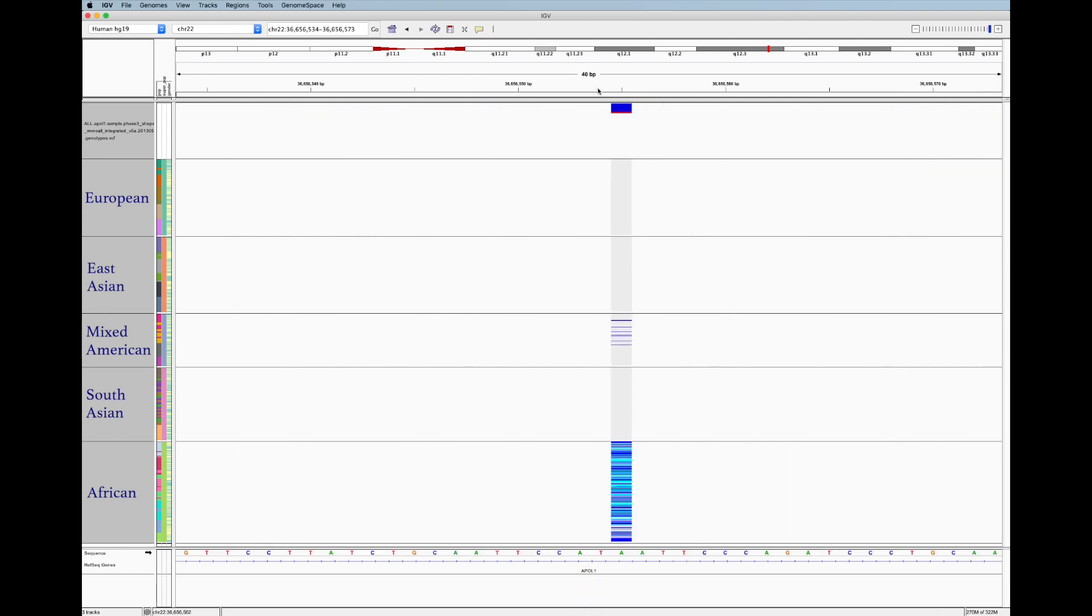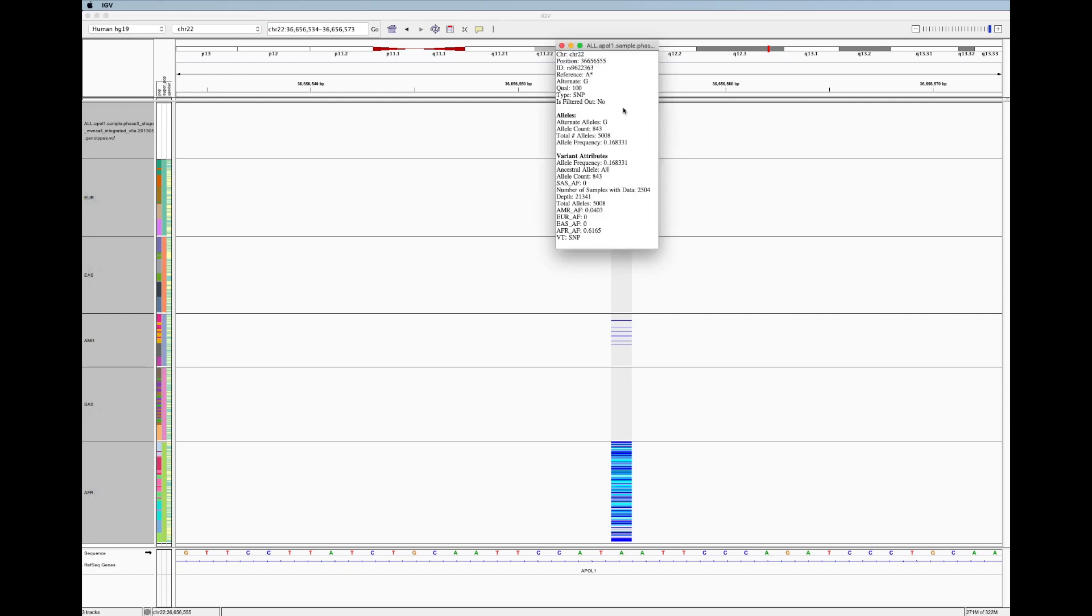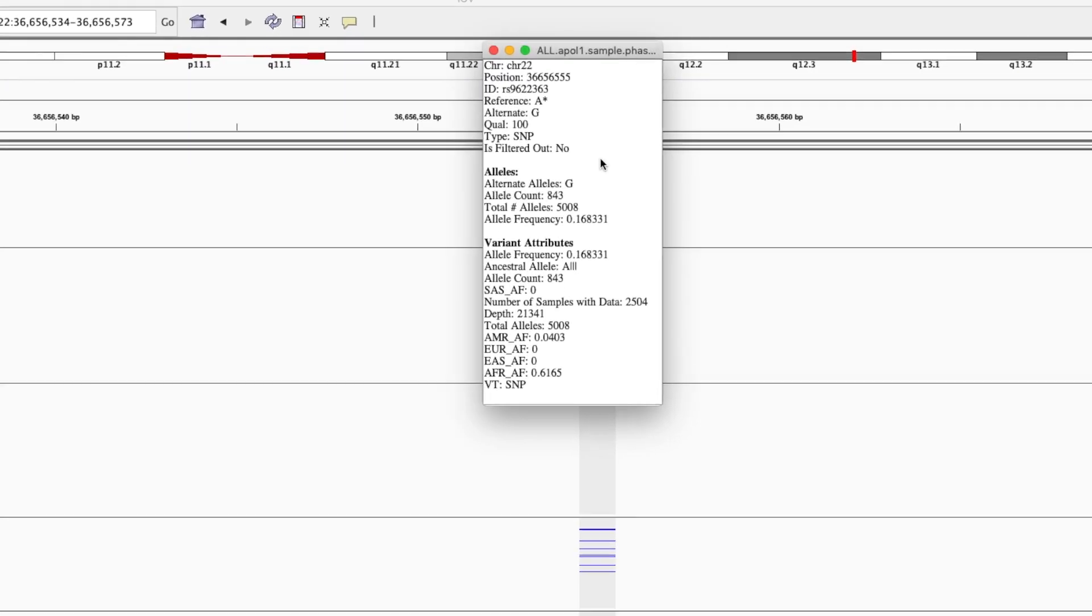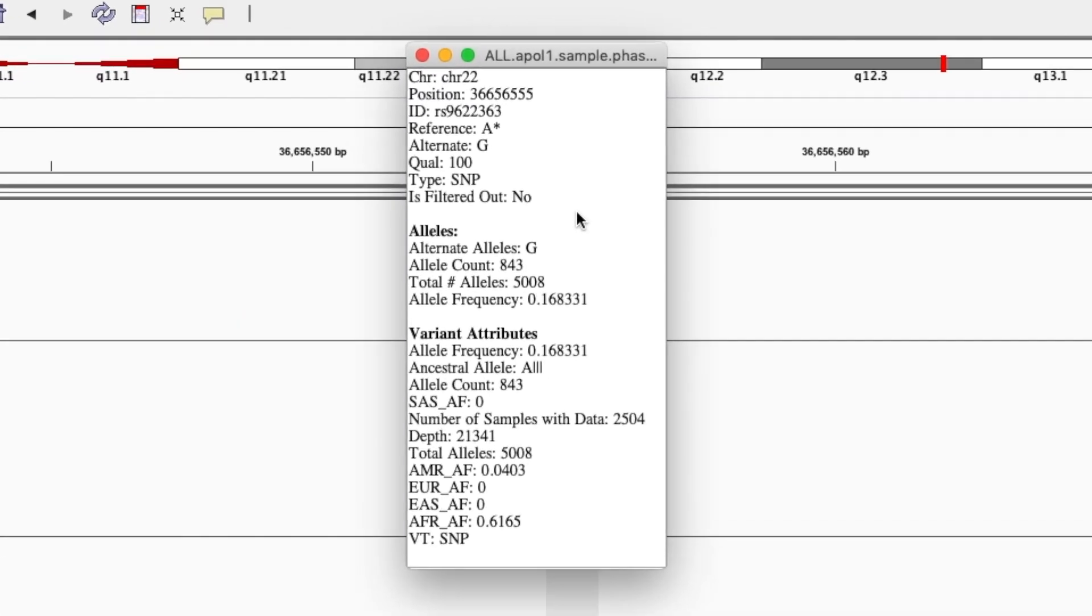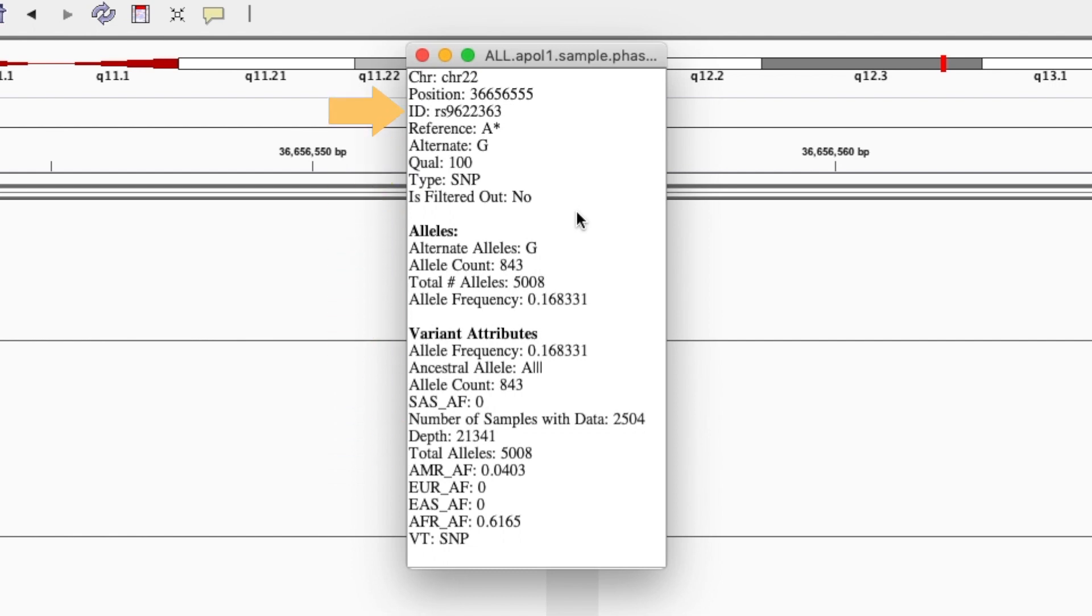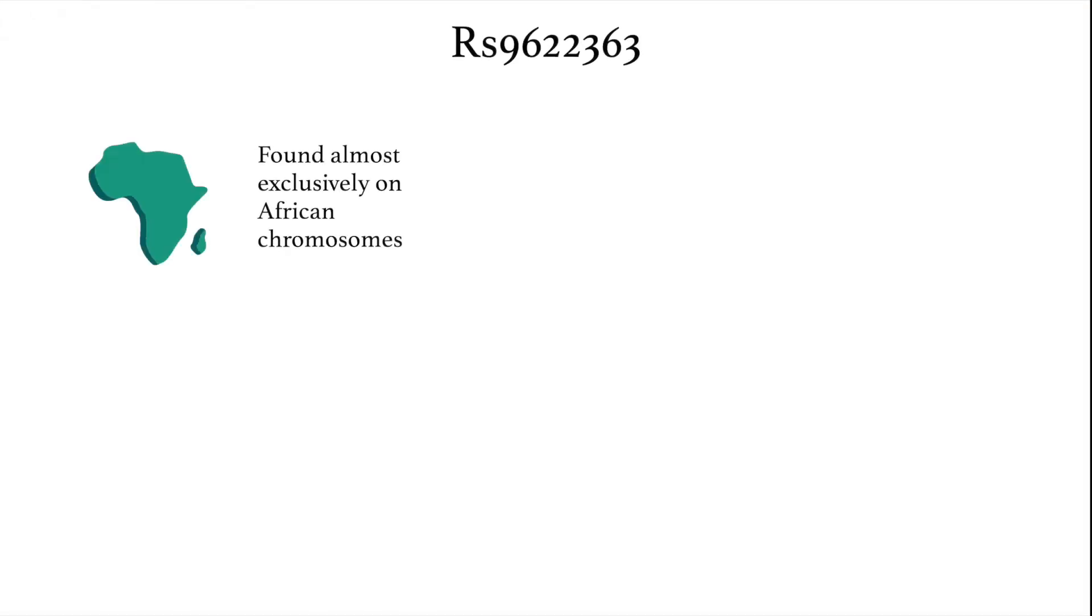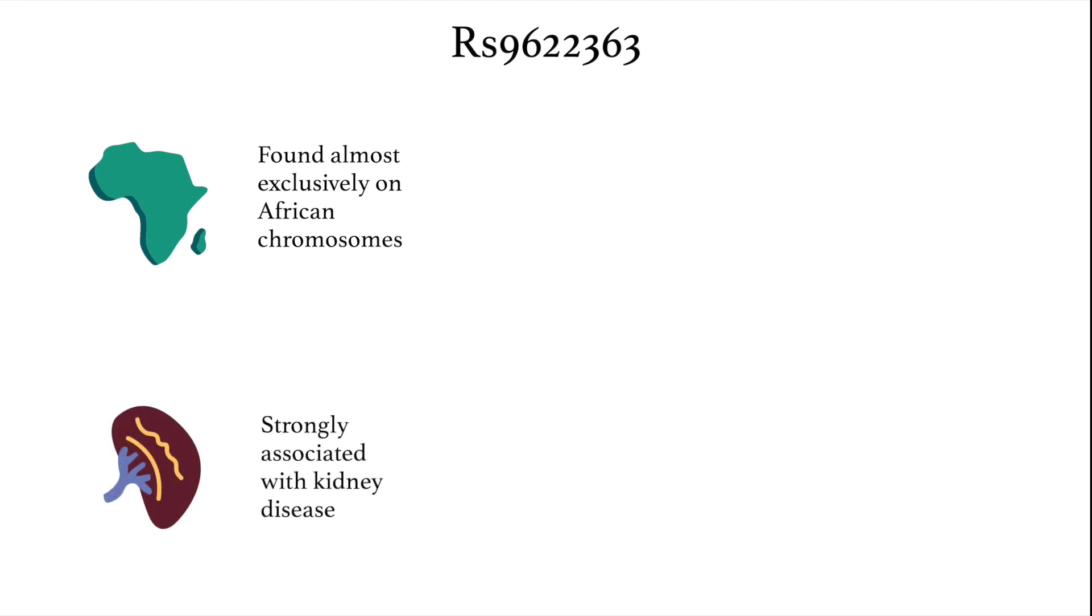If we click on the allele frequency bar, we can see that this variant occurs 61% of the time in the African population, and about 4% of the time in the mixed American population. Using this variant's name in the pop-up menu, a quick Google search reveals that this variant is indeed found almost exclusively in people with African ancestry and is strongly associated with kidney disease.